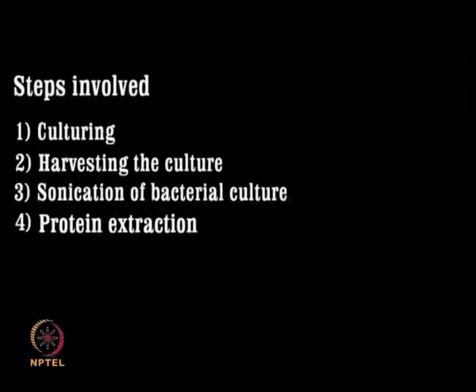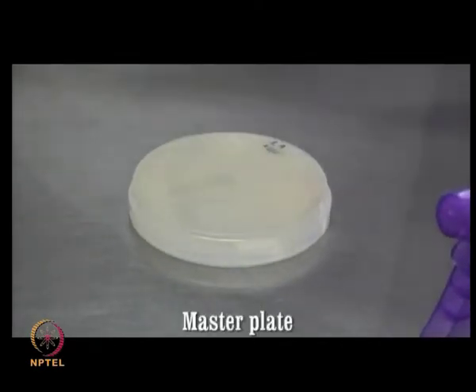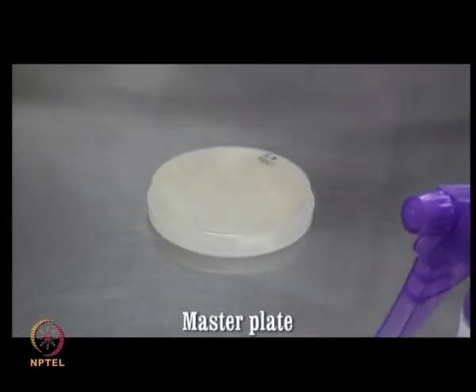This process involves culturing of bacteria, harvesting and sonication of the obtained culture, followed by protein extraction. Bacterial culturing. Clean the laminar workspace thoroughly with ethanol and keep the master plate having the bacterial culture ready.